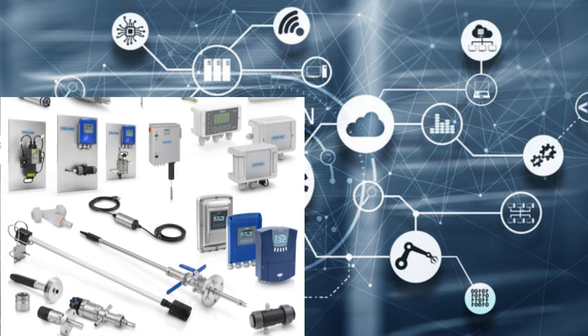Speaking of the environment, it makes me think about all the rivers and lakes and oceans. Turbidity's got to be a big deal for keeping those ecosystems healthy. Oh, absolutely. Turbidity is a major indicator of water quality. Like if the water's too cloudy, sunlight can't get through, which is bad for the plants and animals that live there. Too much turbidity can also mean more pollutants and less oxygen, which makes it hard for fish and other creatures to survive. So it's not just about whether the water looks nice. Cloudy water can really mess things up.